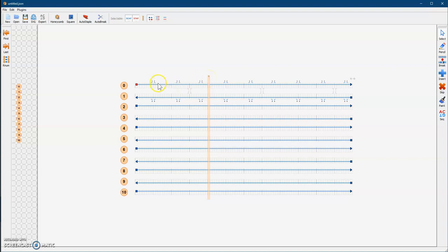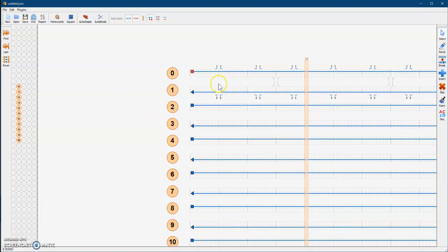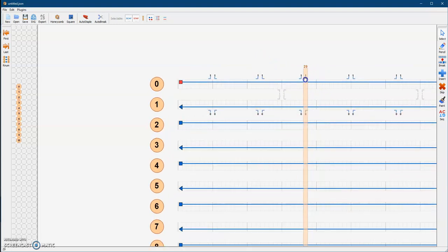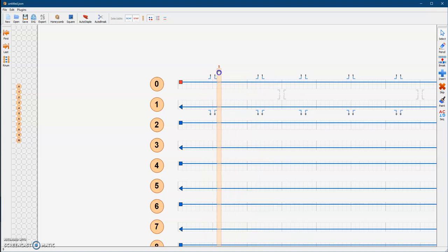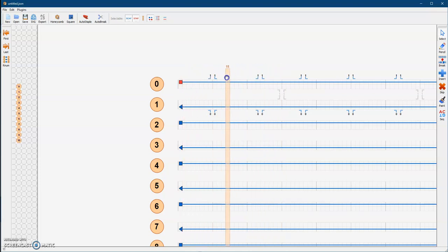Now that that's done, what we want to do is start connecting these strands to each other, because we've got to make one continuous loop out of all of these. That's the basis for any structure that you do, either 2D or 3D. This slider just tells you the position on your DNA bases, from 0 to 1, but for the most part it could be out of the way.